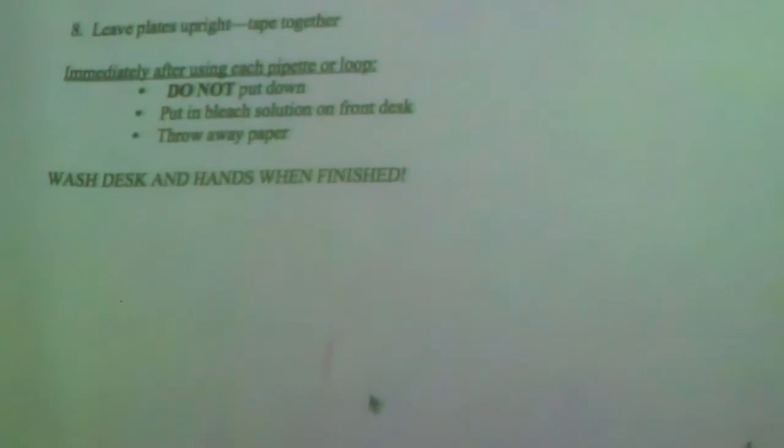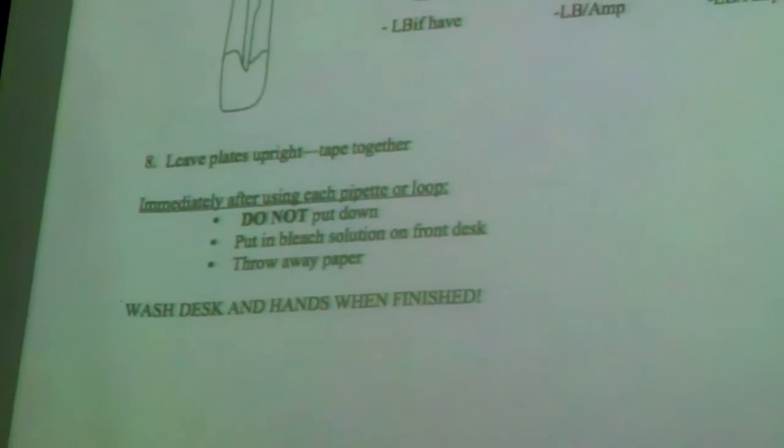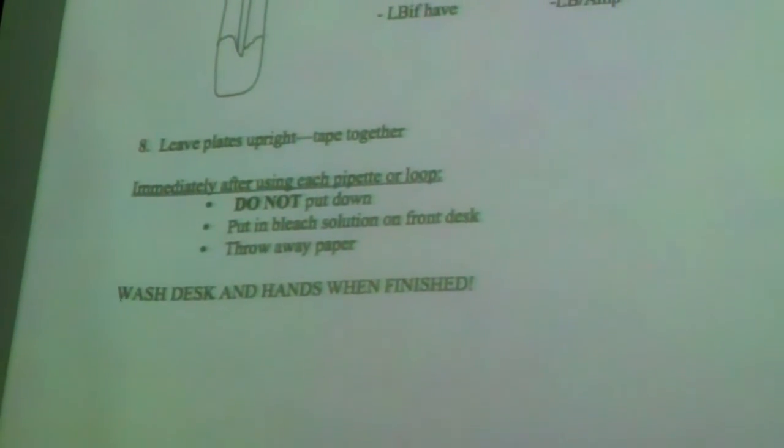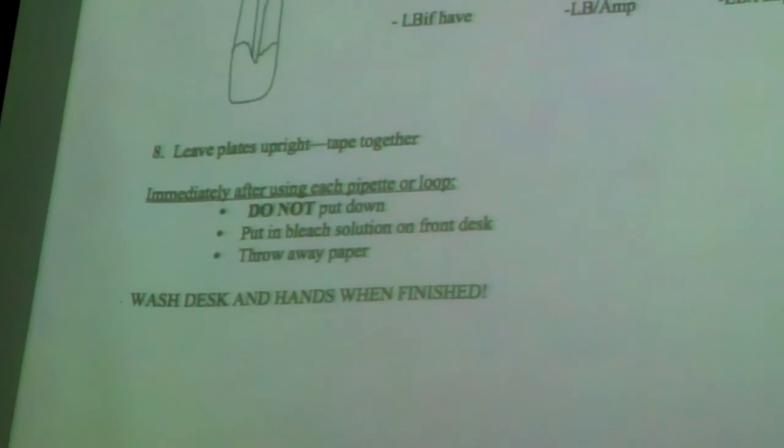There's some issues with this. This lab will not work if you're in a rush, if you're hurrying. That's why we're doing a double block. Okay? So do not put down your pipette or inoculation loop. There are sources of contaminants.